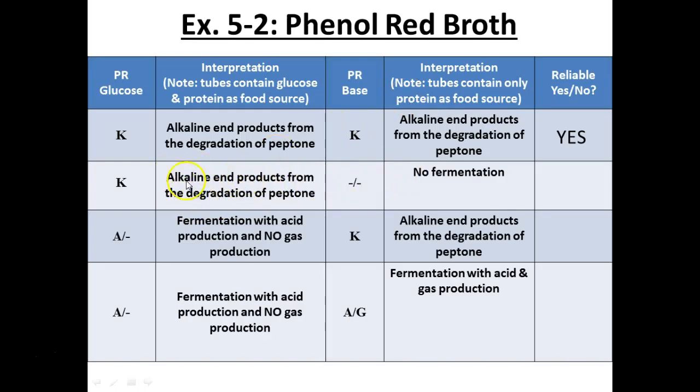What happens if they do alkaline products, right, and the choice between sugar and protein, but then when you give it protein, it doesn't do anything? Is this a reliable result? No, it should eat the protein again, right? Why didn't it? What's going on?